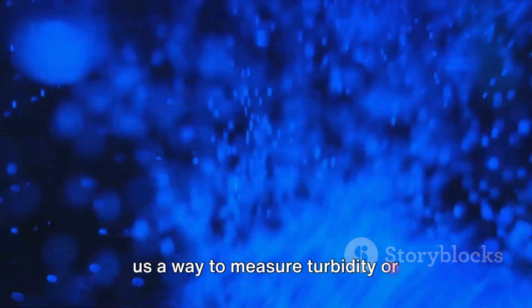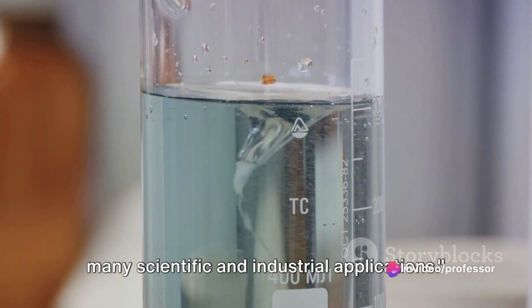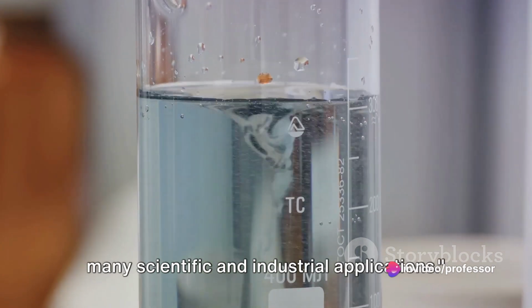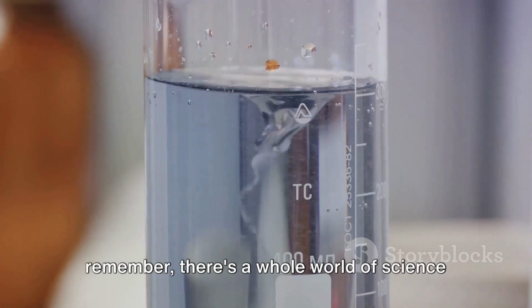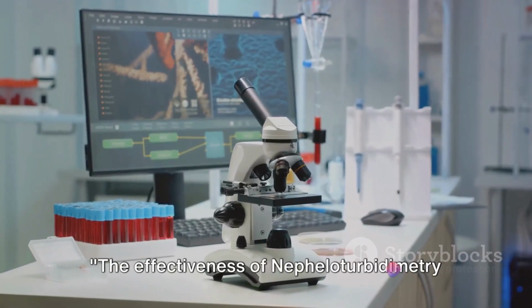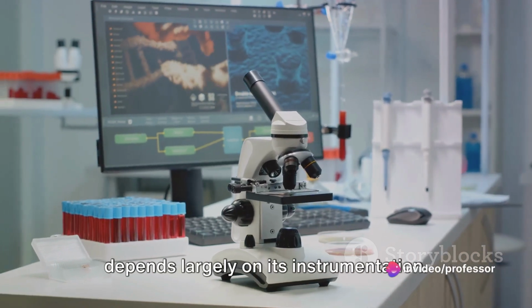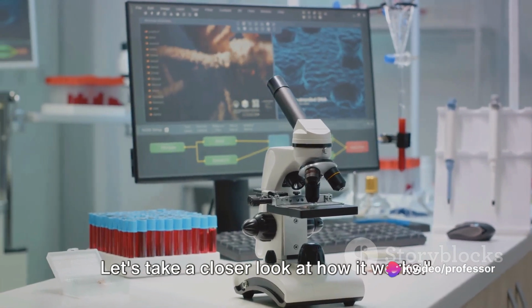Nepheloturbidimetry, in essence, gives us a way to measure turbidity or cloudiness in a solution, proving vital in many scientific and industrial applications. So next time you see a cloudy solution, remember, there's a whole world of science hidden in that turbidity. The effectiveness of nepheloturbidimetry depends largely on its instrumentation. Let's take a closer look at how it works.